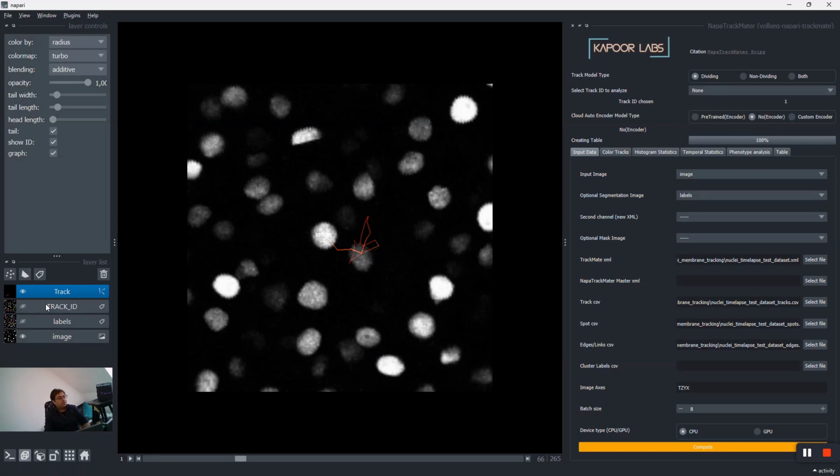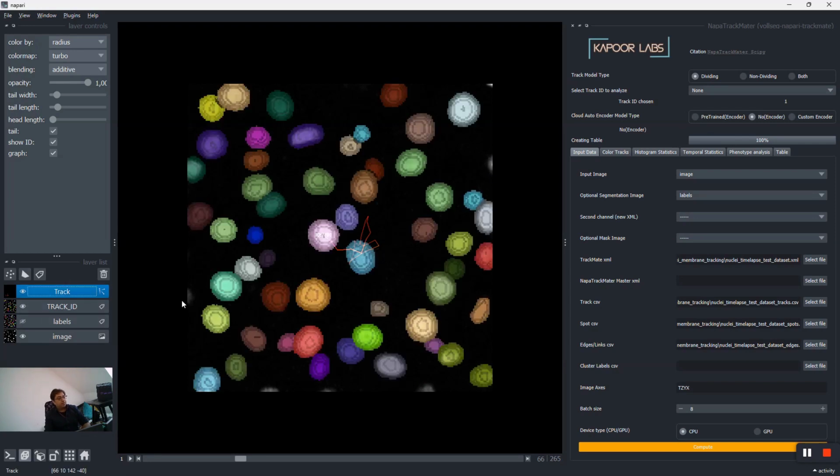Now that's the thing, especially in 3D data, that quantification of shapes in 3D data just from the segmentation labels is kind of inaccurate. You can measure the radius by assuming that it's a sphere, or you can just compute a bounding box on it, or you can somehow approximate the surface area by meshing cubes. But it's nicer to actually use a trained autoencoder model to convert these segmentation labels into point clouds and then compute the properties, the shape features from that autoencoder model.